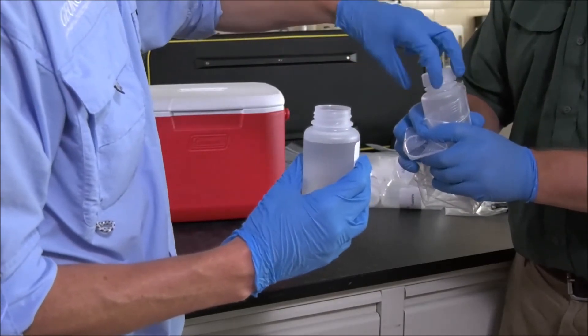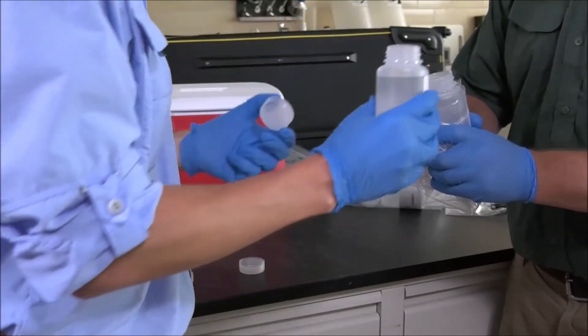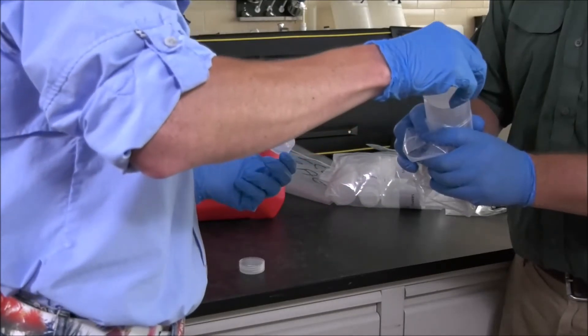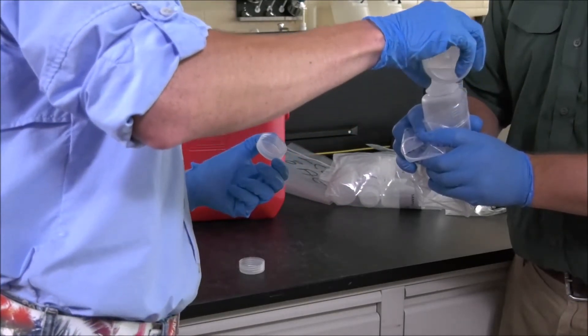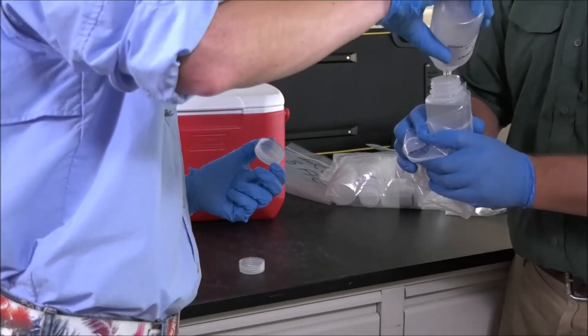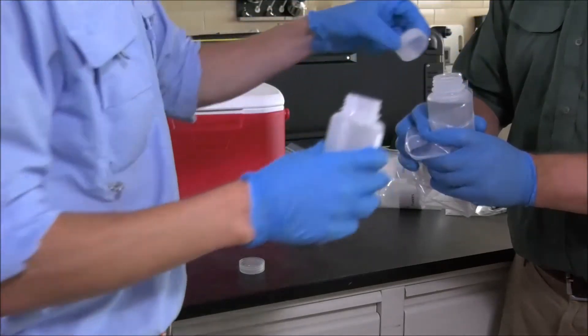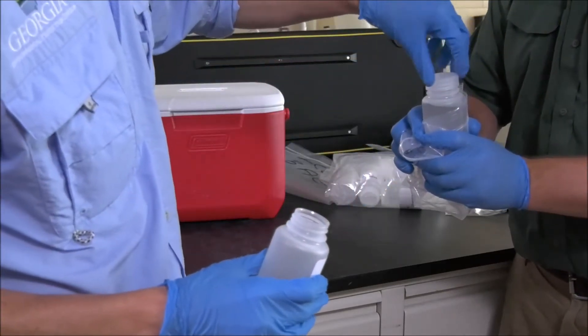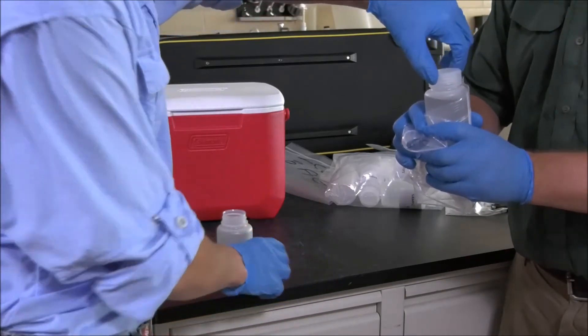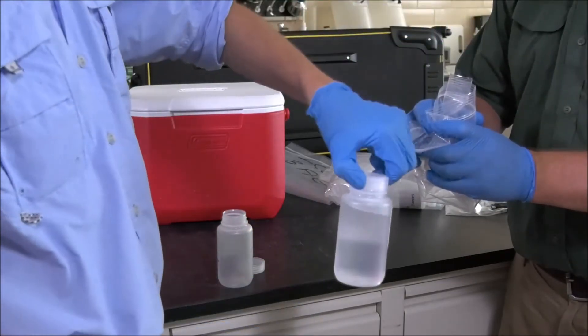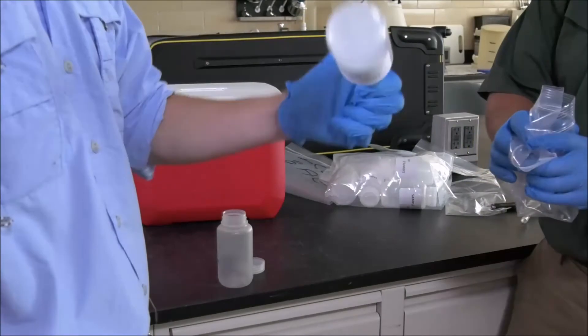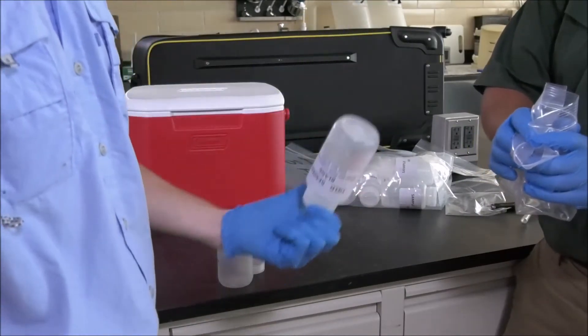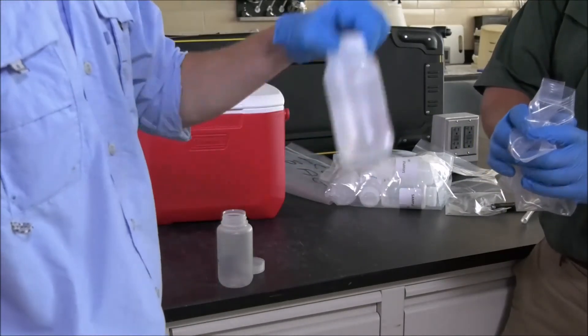Dirty hands will then move the empty field blank bottle to the opening. Clean hands will remove the cap and keep the cap in their hand while they pour the full field blank bottle into the empty field blank bottle being held by dirty hands. Clean hands will replace the cap on the field blank bottle, then remove the newly filled bottle from the plastic bag and mix the preservative with the field blank water by inverting the bottle at least five times.